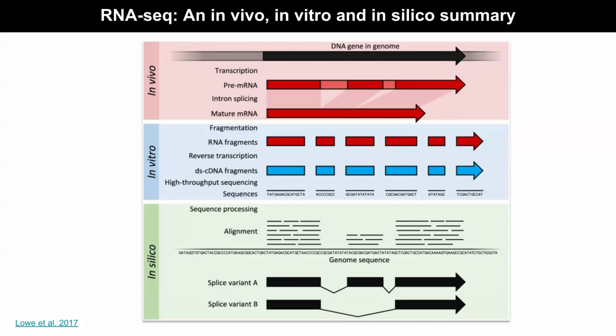These are of different lengths. Now, how many copies? Imagine when you run the sequencer, you have a choice of how many cycles of PCR you want, and by cycles I mean cycles of PCR, which is the bridge amplification part. Let's say I do 5 cycles for this and 5 cycles for that. So both of them will be amplified in a similar fashion, and you can imagine the final output is going to be comparable. But what that essentially means is that, just because I get a lengthier version of this sequence, its final quantification will be slightly larger to begin with.